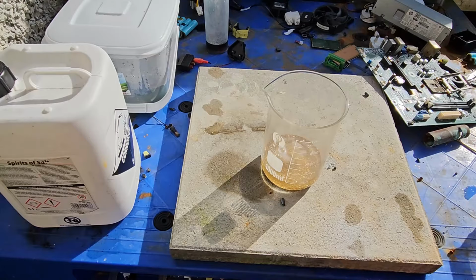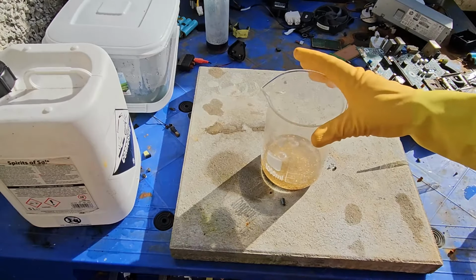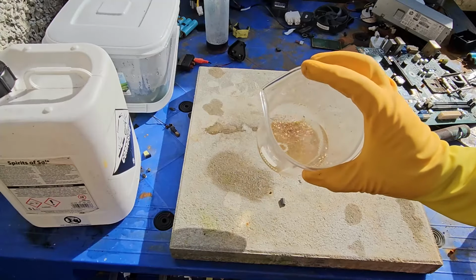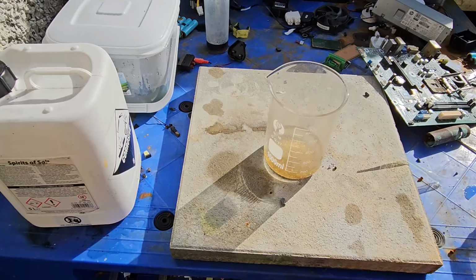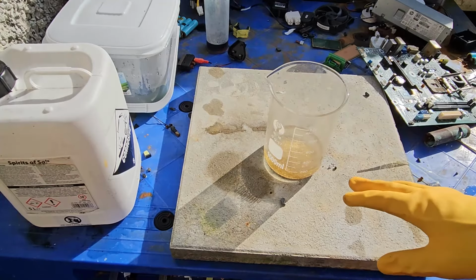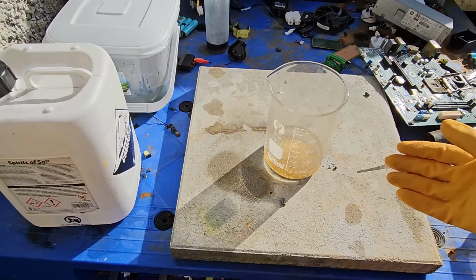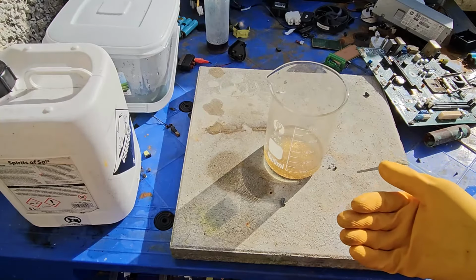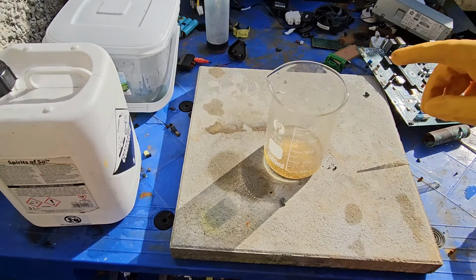So we just have a couple of drops of bleach put in there, and you can see already there's a reaction taking place. So we'll let that go. The thing about bleach and doing this is you have to add and keep adding, because the bleach does disappear, which essentially gets used up fairly quick, so you will have to add more. So we're going to let that work away.